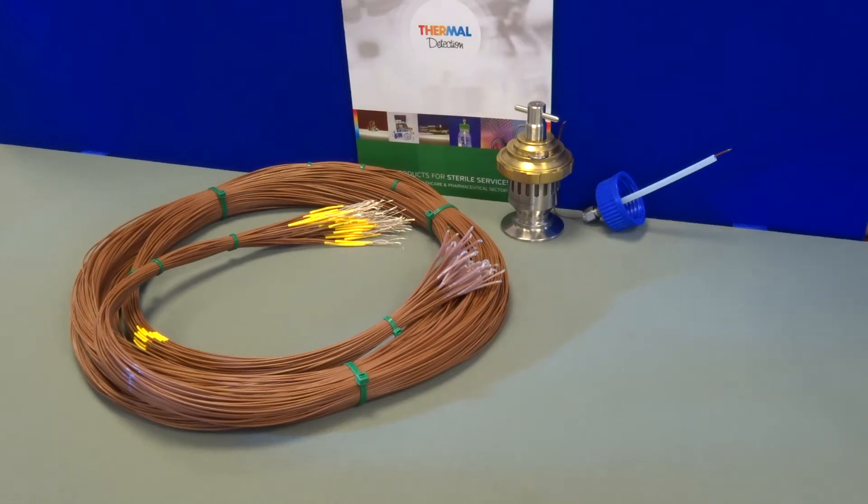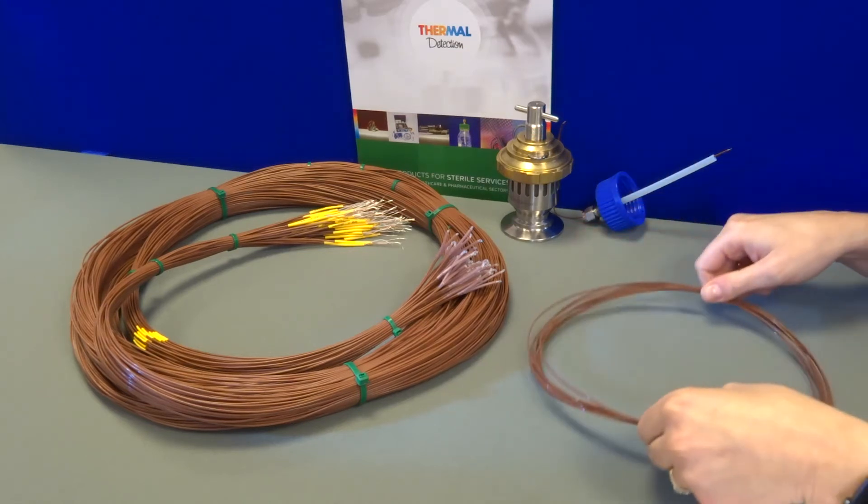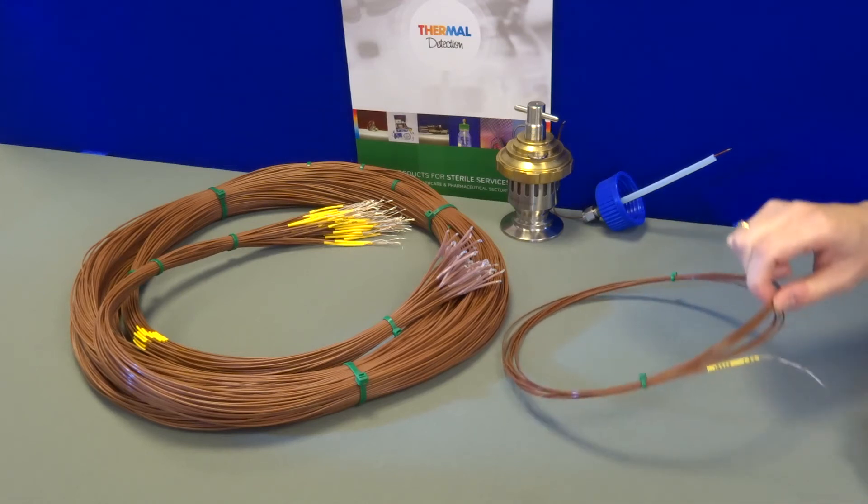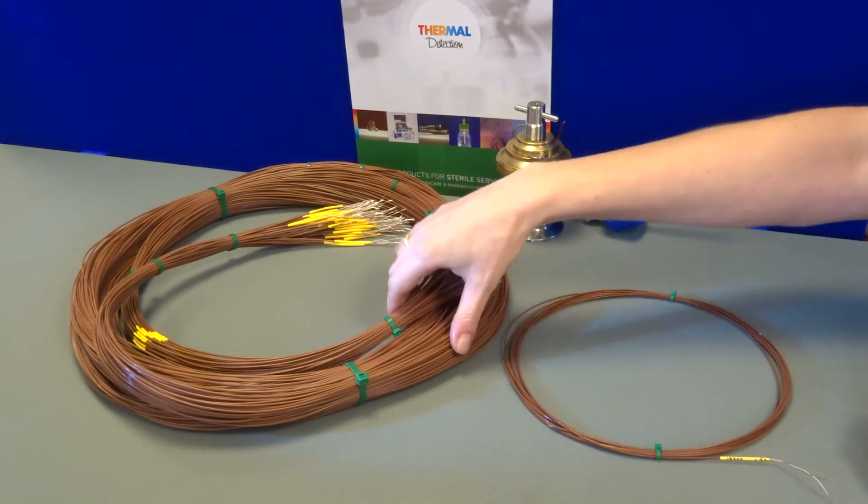Welcome to Thermal Detection's product videos. Today I'm demonstrating the pre-cut validation thermocouple, both in individual format and also in looms.